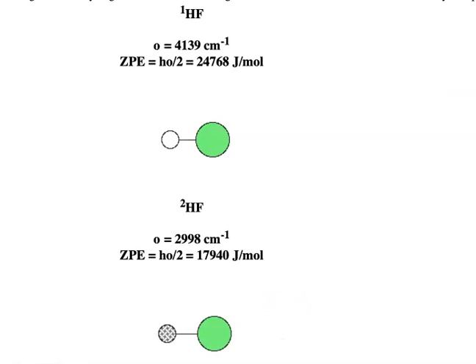Probably the easiest way to understand this is with a pretty simple system. What you're looking at here are two different HF molecules. Of course, we as organic chemists are not too interested in this particular molecule, but it'll demonstrate what IR is doing to a molecular compound. One of the things you'll notice is that in this HF bond, it's almost like there's a spring between it that's going boingy, wingy, wingy. We call this molecular vibrations, and it turns out that the frequency of this is at a really particular resonance.